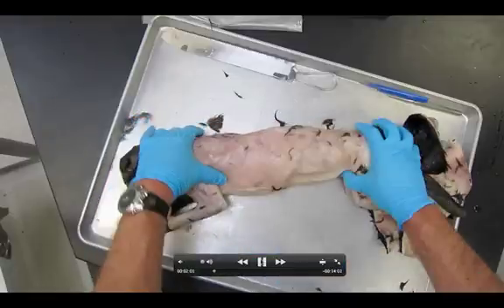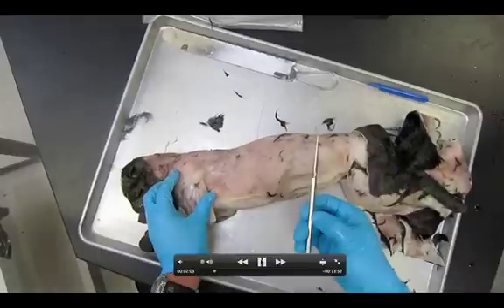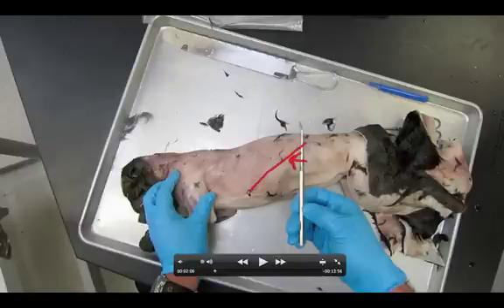I'm just going to draw you these lines. The first tool we're going to use is our blunt probe right here. You're going to use the blunt probe and tease mainly at the tissue on this side of this line. Here's my line that I'm going to be going down — you're going to try to get yourself underneath this tissue here. Let's hit play and watch how we do this.